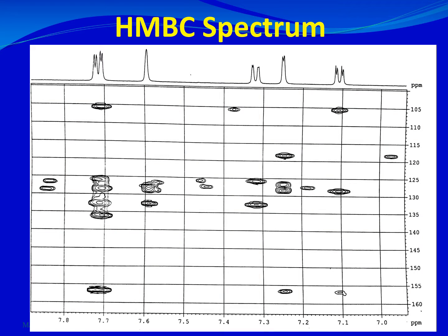Let's see how we can read the spectrum and extract information. Here is a part of the HMBC spectrum of a molecule. Since it's a heteronuclear technique, we see correlations between protons and carbons. The carbon scale is shown on one axis and the proton NMR scale on the other, with the proton spectrum drawn at the top for convenience. Just like HSQC or HMQC, there is no diagonal in the HMBC spectrum.